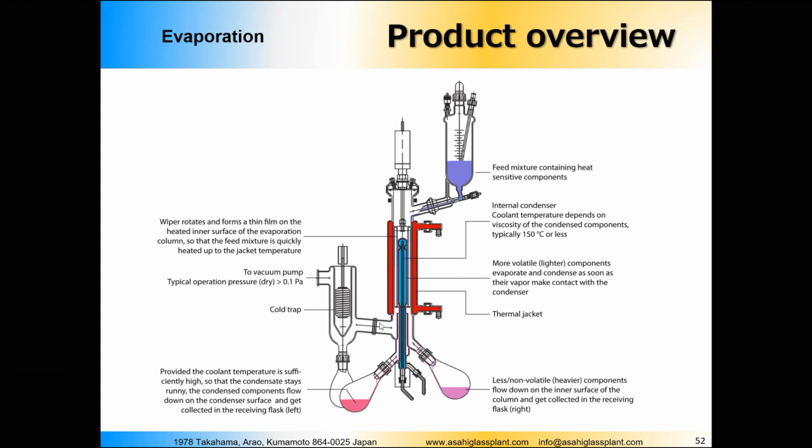We might have some residual light solvent, which is afterwards collected in this cold trap, and there is a third receiver at the backside. I do hope that I explained this properly.